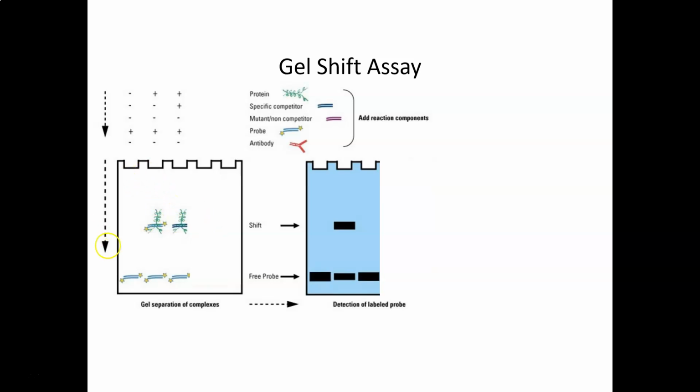So even though our protein is binding to DNA and it's shifting that DNA, that shift is not visible in our gel because all of that DNA is cold, invisible. And since the probe itself is so outcompeted by this cold, invisible DNA, we see a restoration of that free probe band there. So adding more evidence that, yes, our protein was binding to that sequence.